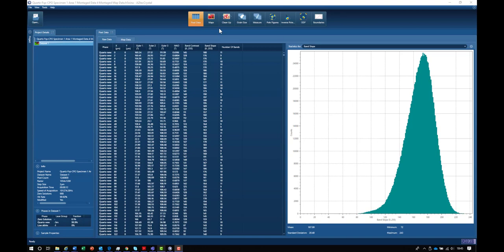The raw data that we collect is shown in this table here: a series of X and Y coordinates, some phase information, and three angles known as the Euler angles, which correspond to the three-dimensional orientation of the crystal lattice at each point.